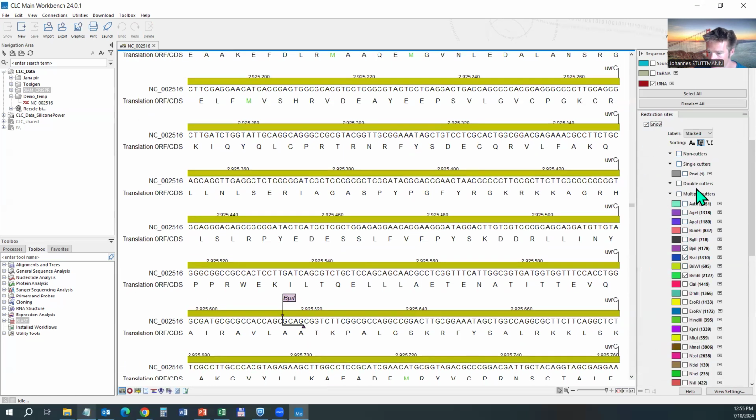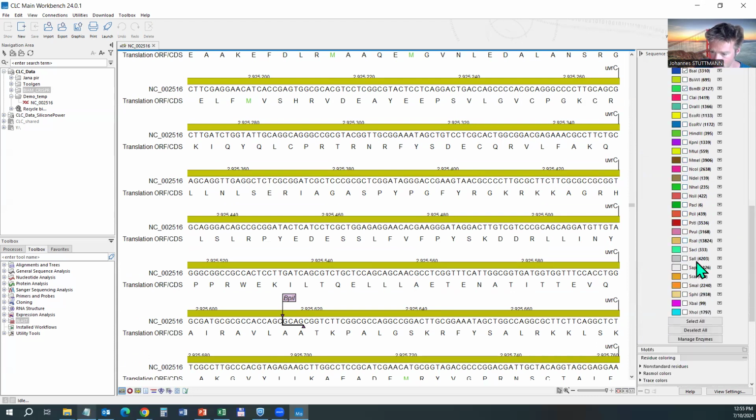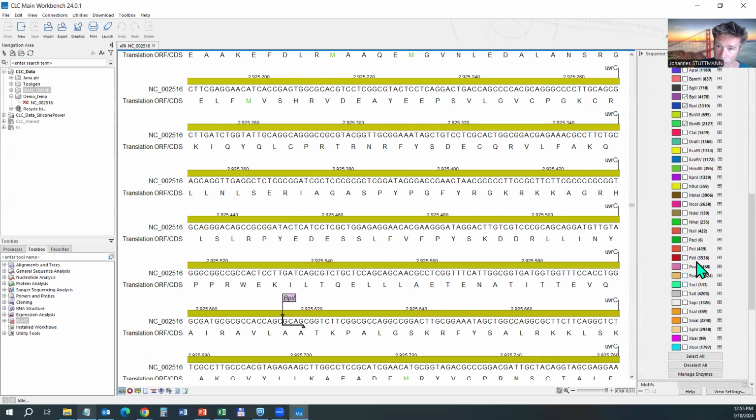This is, for example, a selection of restriction enzymes that we have in the freezer. So everything we have. And of these, I selected some that are by default ticked, so shown or not shown. Yeah, and you can save these settings. Thing is that you have to do this for any type of file. So for example, you now have a circular view. So this is a linear view. If you have a circular DNA view, then it will be a new set of view settings actually.